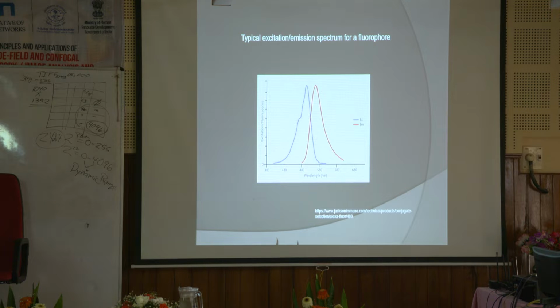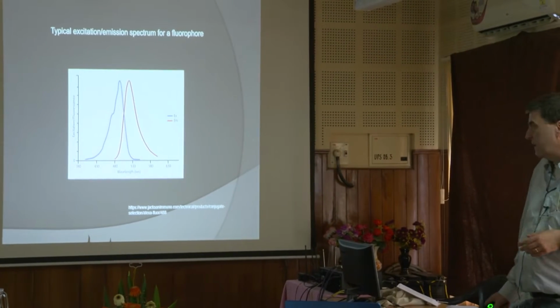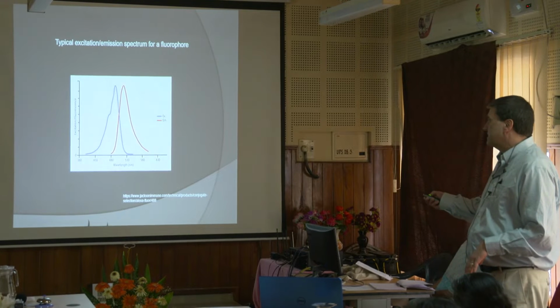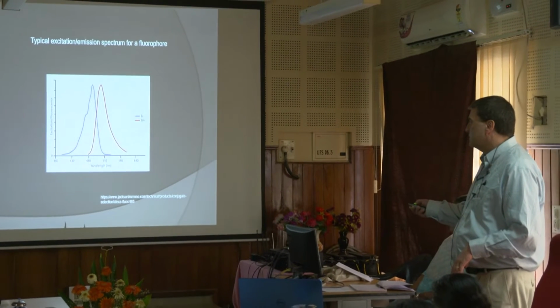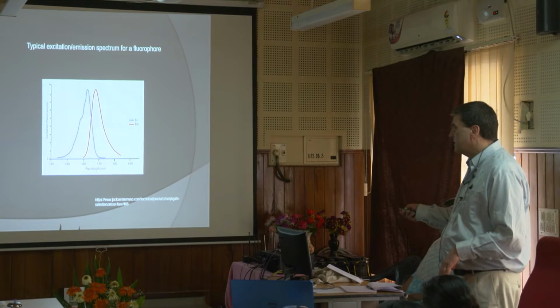So this is one of my favorite dyes, and it's actually called, if you look down here on the bottom, Alexa 488. It's a green dye. The reason I know it's green is because I work with it all the time. But the other reason is basically it has the color of the emissive wavelength. And it's in the 500 some range, the peak. So that's your green spectrum.